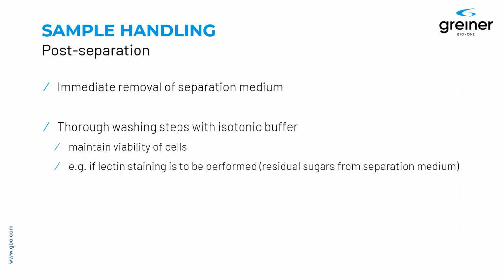After separation, the separation medium should be removed immediately with washing steps. First of all, separation media might have a slight cytotoxic effect on sensitive cells, but further, the medium might also affect downstream methods. For example, saccharose-based media can disturb lectin staining.